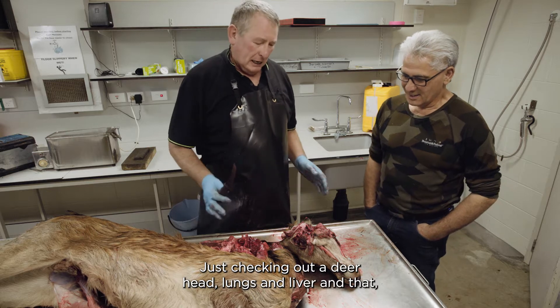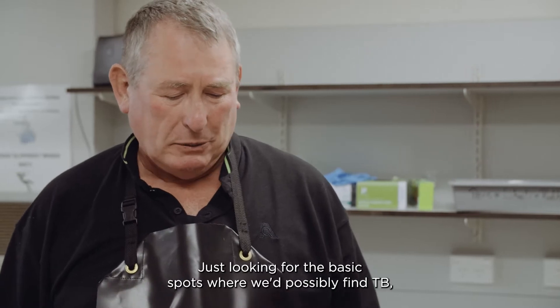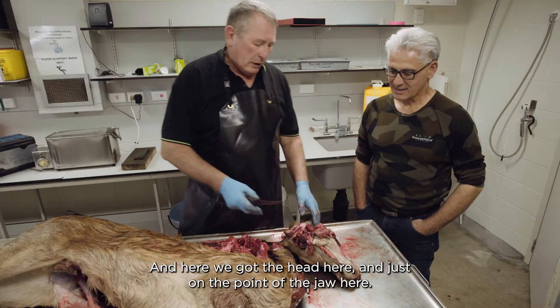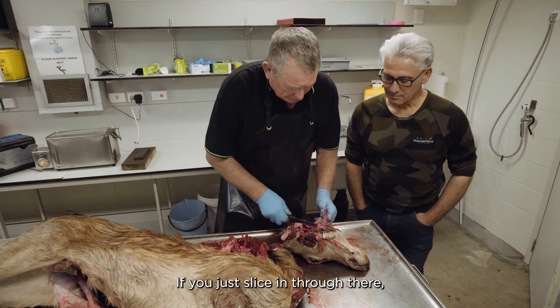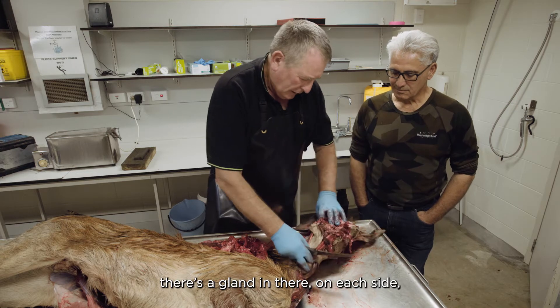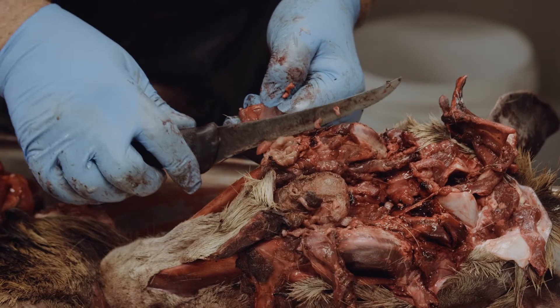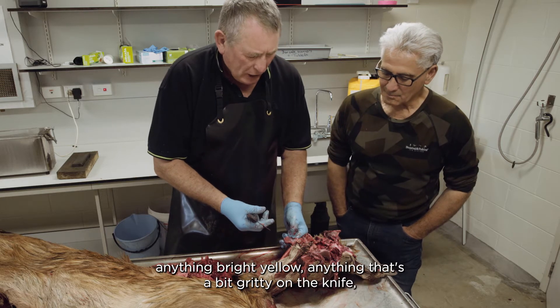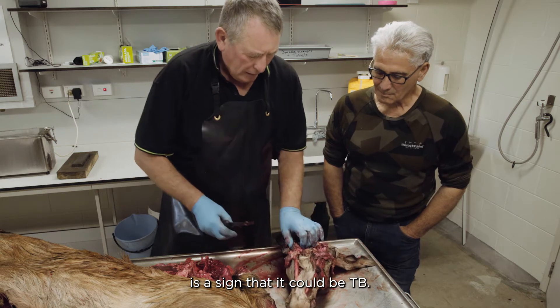We're checking out a deer head, lungs, and liver, just looking for the basic spots where we'd possibly find TB - the primary sites where it'd enter the deer. Here we've got the head, and just on the point of the jaw, if you slice in through there, there's a gland on each side. What we're looking for is any pus, anything bright yellow, anything that's a bit gritty on the knife - that's a sign that it could be TB.